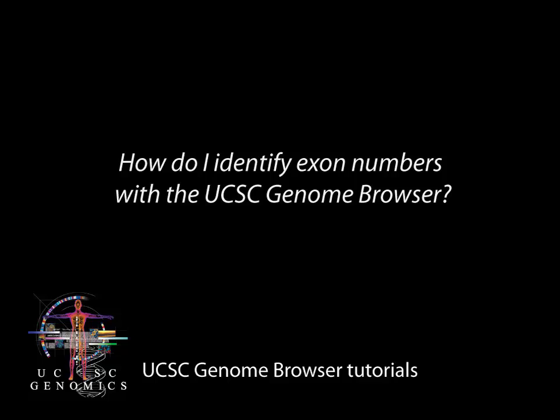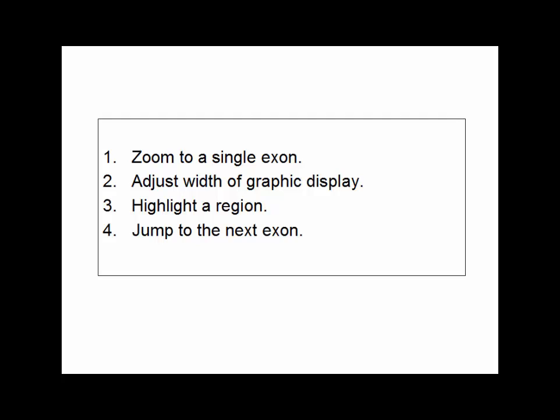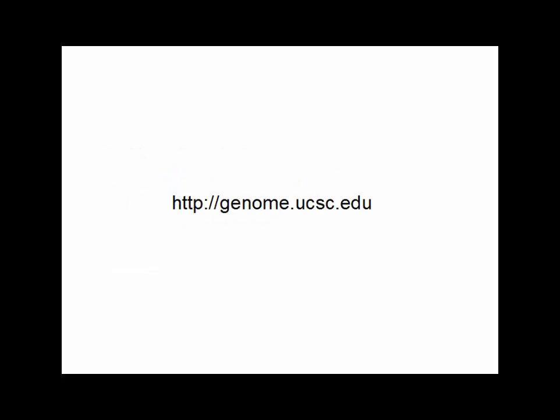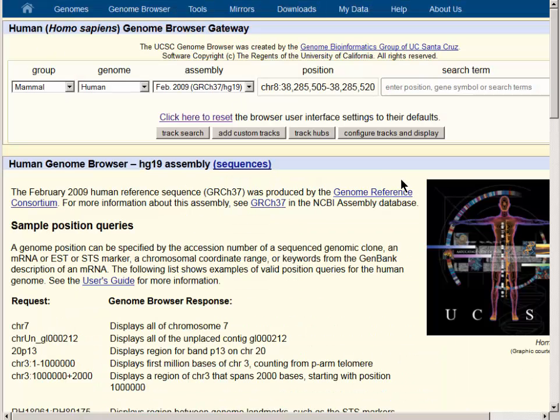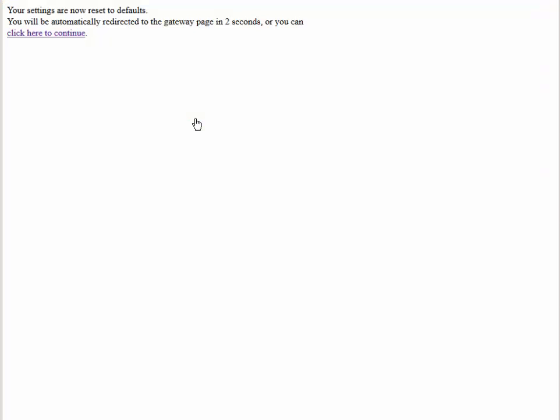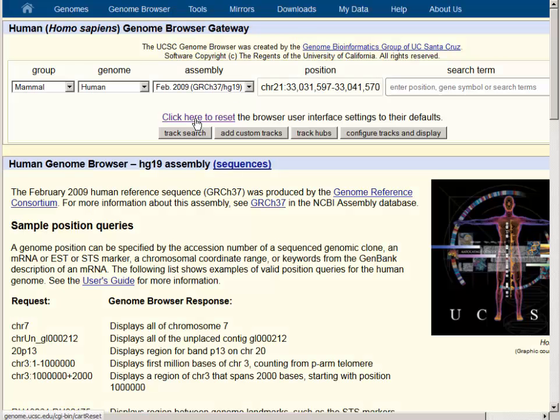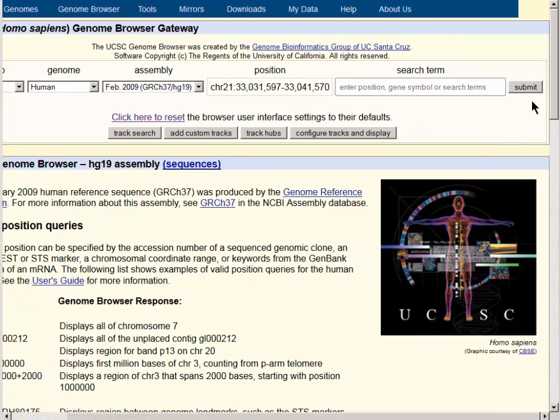How do I identify exon numbers using the UCSC Genome Browser? Let's visit the browser at genome.ucsc.edu. We will start at the main page, and in the upper left-hand corner we'll find links that take us to where we can choose our genome of interest. We will click here to reset the browser to the default genome assembly, which is the human HG19 assembly at the present time.